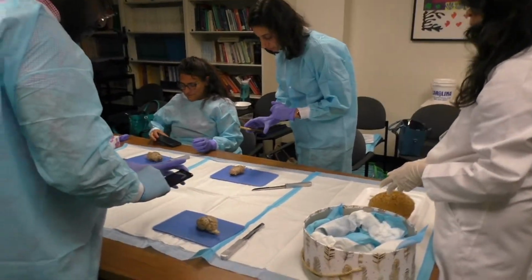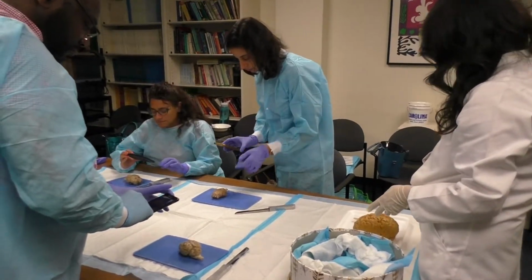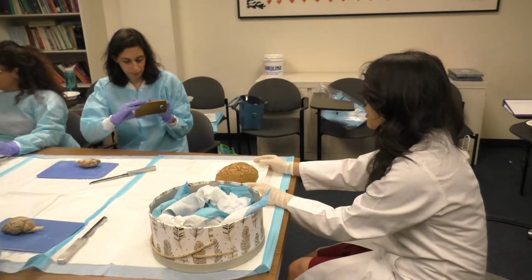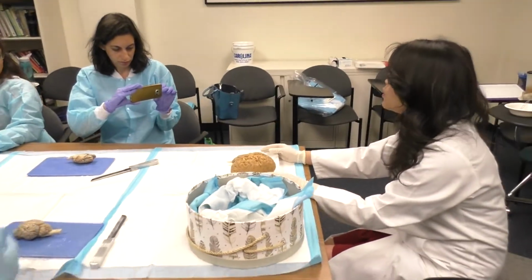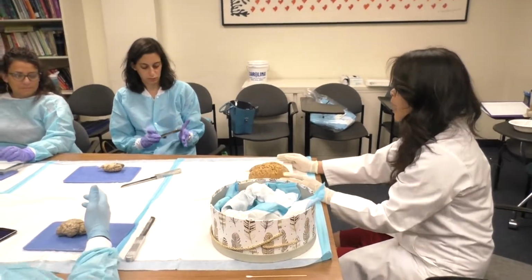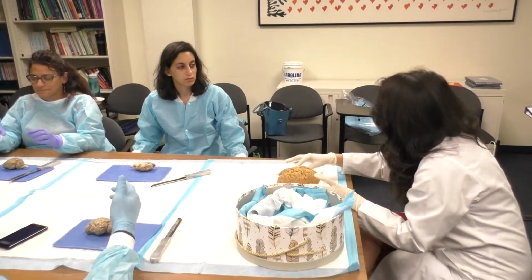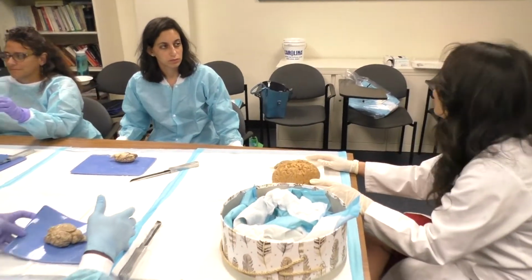So your atlas can start with that. And then we'll start kind of cutting into it. That can and should be labeled on these overall views of the sheep brain. Obviously the cortex, information about the folding, what that means. What are the major functions of these major lobes that we talked about?